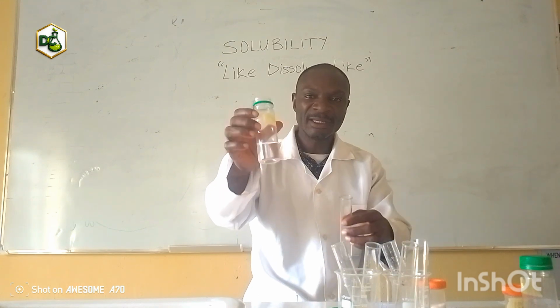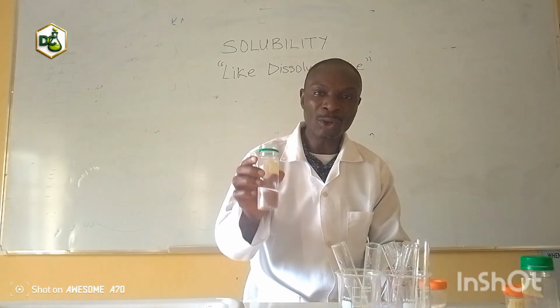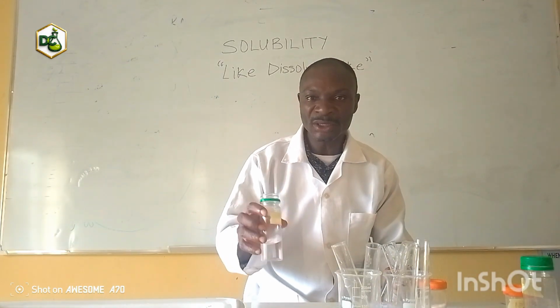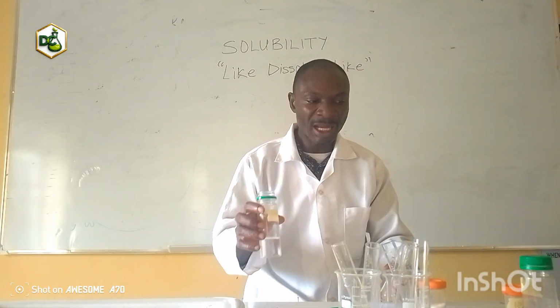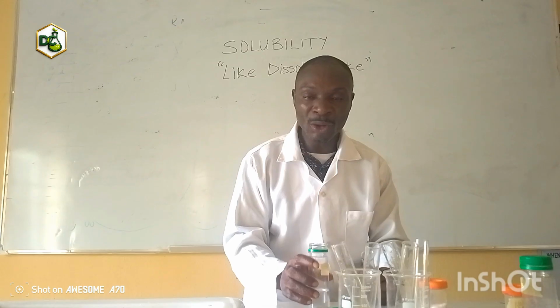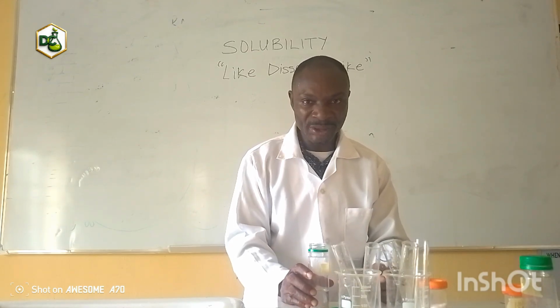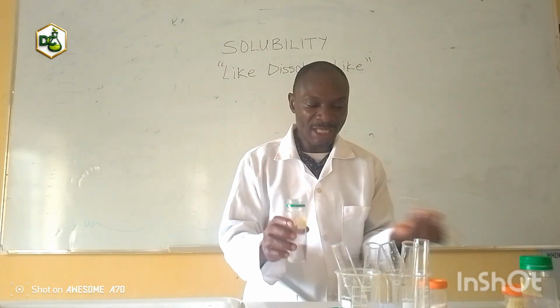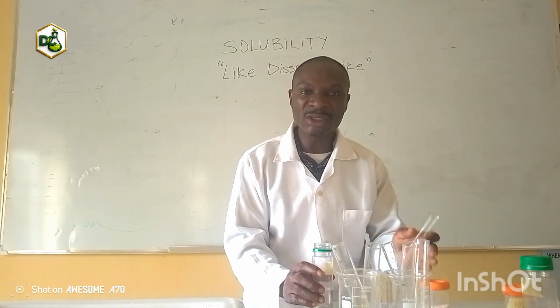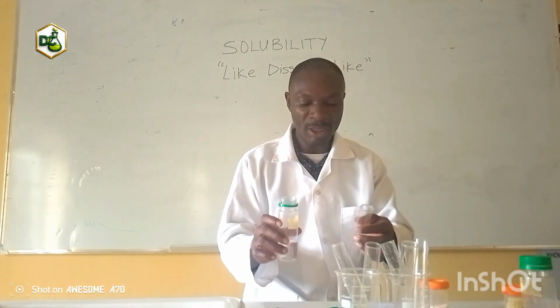Now, I have this oil. It's an organic substance, and organic substances are most times non-polar. I'm going to introduce salt, which is an inorganic substance, which is polar. You'll discover what happens, whether the salt, which is polar, will be dissolved in oil, which is non-polar.